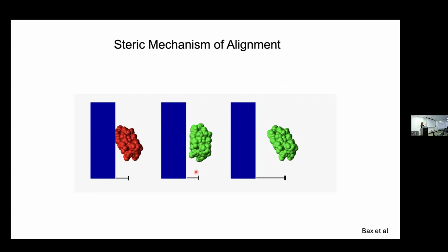So in order to get aligned, you have to be anisotropic. And if you start messing with the shape and creating disorder, you're going to start averaging the dipole interaction, just like in the solid. So in the solid state, if you're trying to do a cross-polarization experiment, does it work well for a disordered region? No. Why?